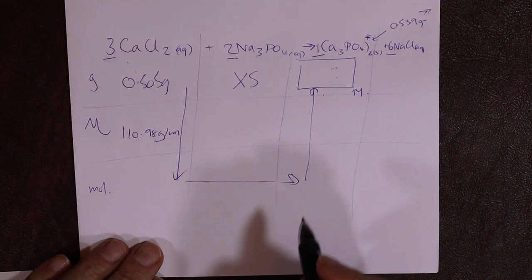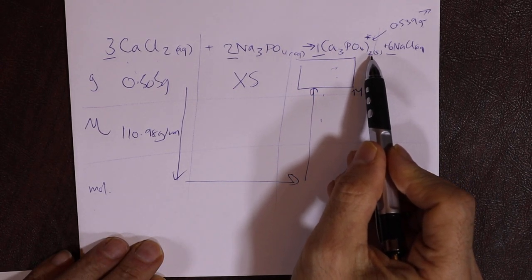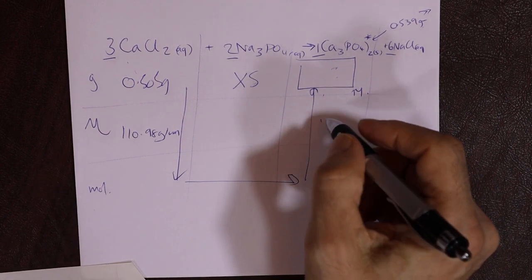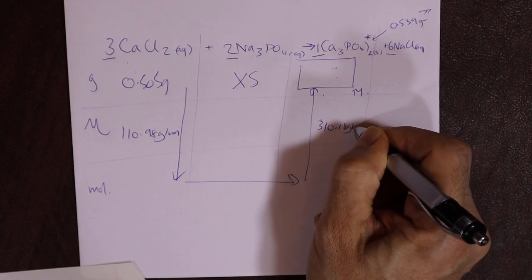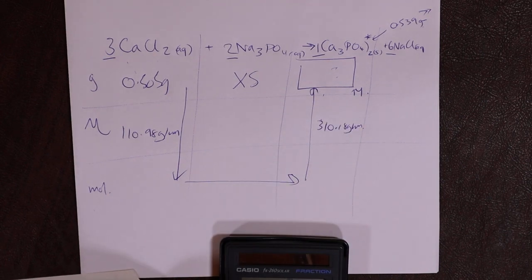Okay. The other thing we can fill in is this one now. This one, 3 calciums and then 2 phosphates, which contains 2 phosphorus, 8 oxygen. If you add that up, it's quite a lot, right? It actually adds up to 310.18 grams per mole. Okay, now we run our numbers. Okay, so grab a calculator. So I can locate mine. There it is. Okay, so nice and easy.